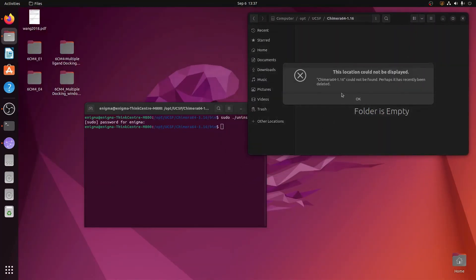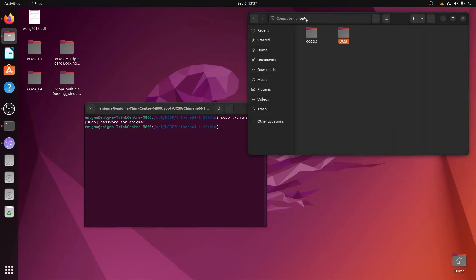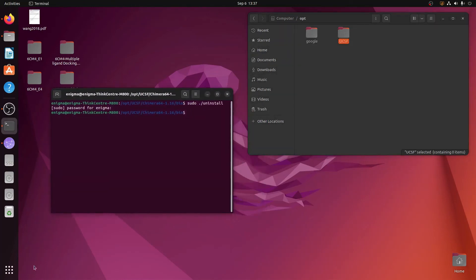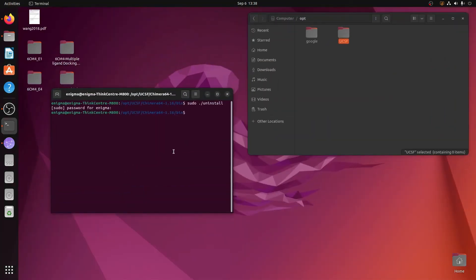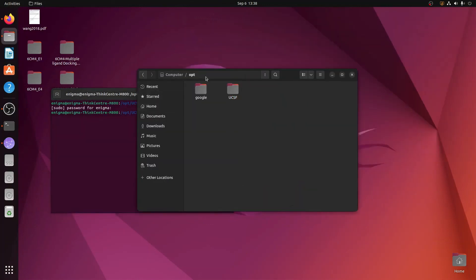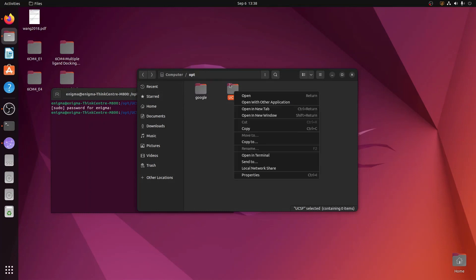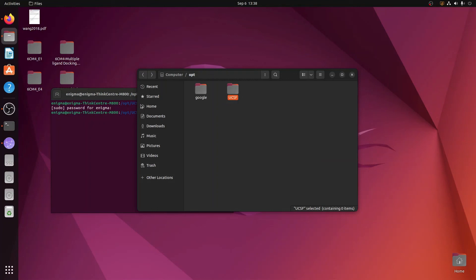It could not be found — meaning uninstallation is done. If you go to the opt folder you will find the ucsf folder is now an empty folder. Go to the Show Applications button and scroll down — you will not see the Chimera icon anymore. This is the correct way to uninstall Chimera.